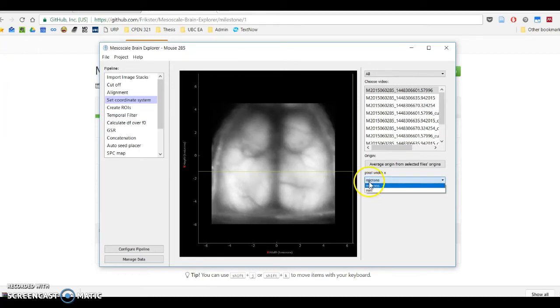Also note we'll probably have a nanometer scale here as well, since 1 micron is the size of a bacterium, so for those doing cellular data you might want something even smaller. But yes, just so you know, this doesn't currently really do anything, but it will in the future.